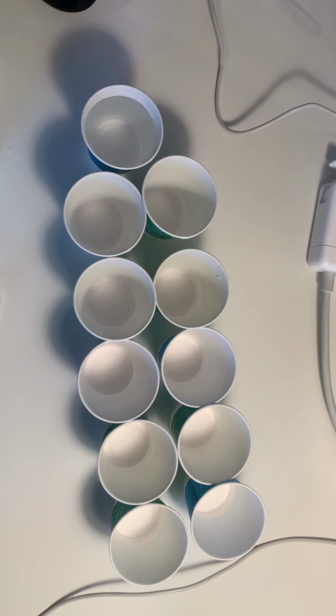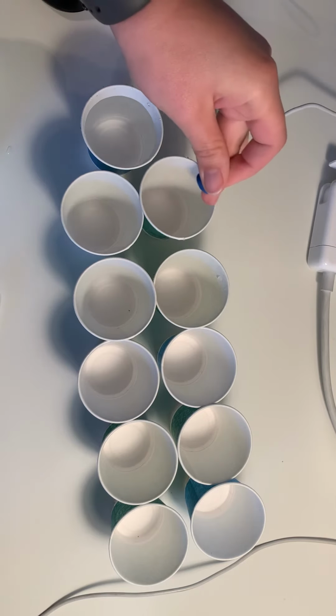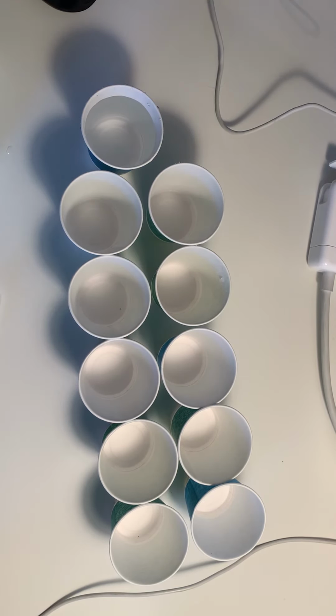Okay, this video is going to go through the procedure for the parts per million lab. When we're looking at parts per million, we're looking at if we divided the substance into 1 million parts, how many parts of that are solute and how many parts of that are solvent. So the parts per million number is how many parts of the whole are actually solute, the thing dissolved.